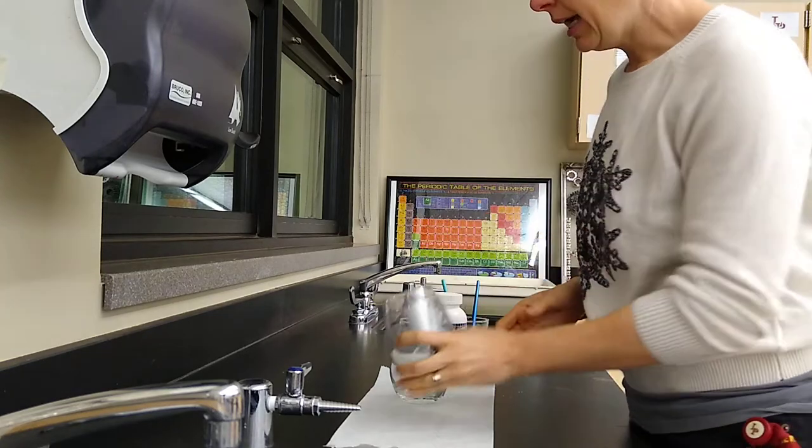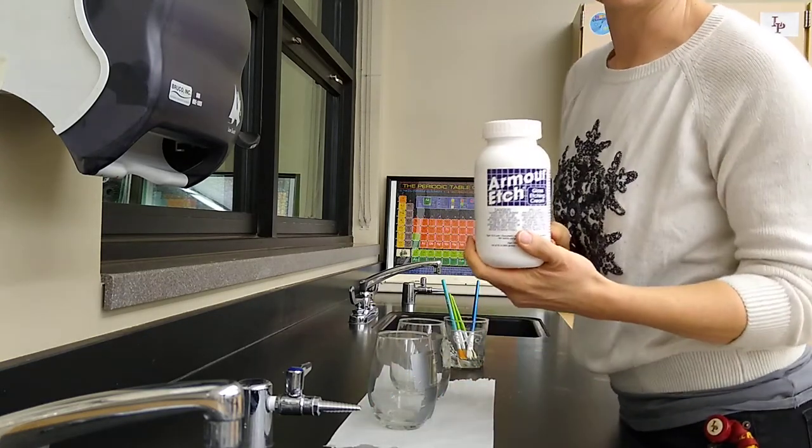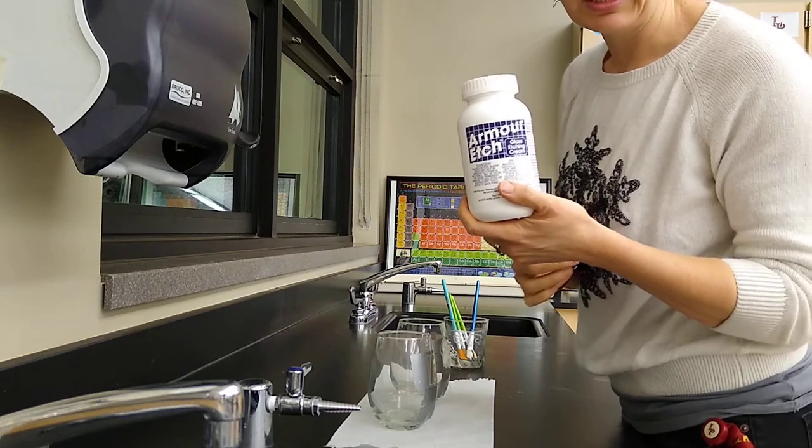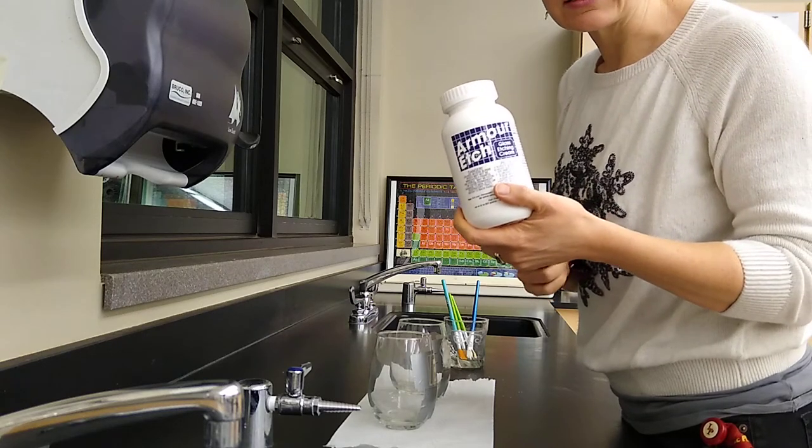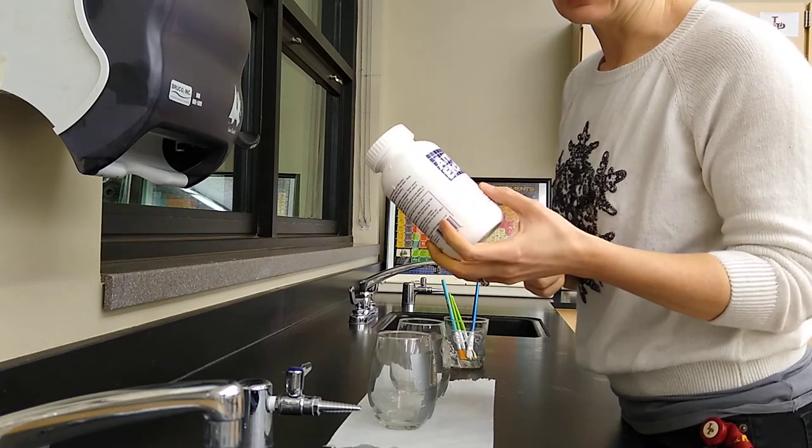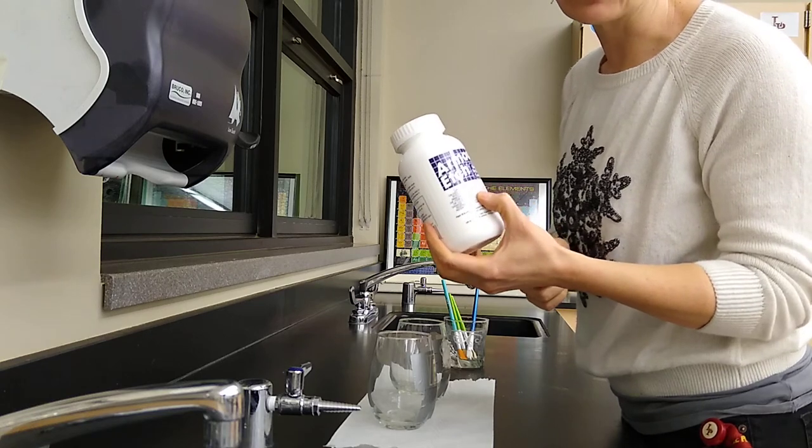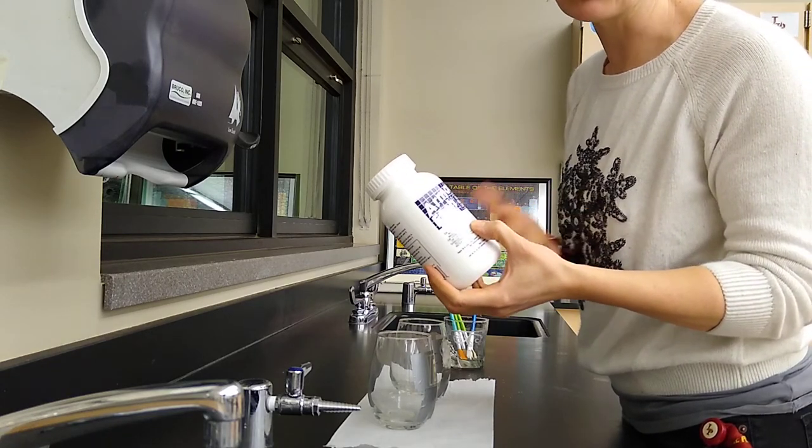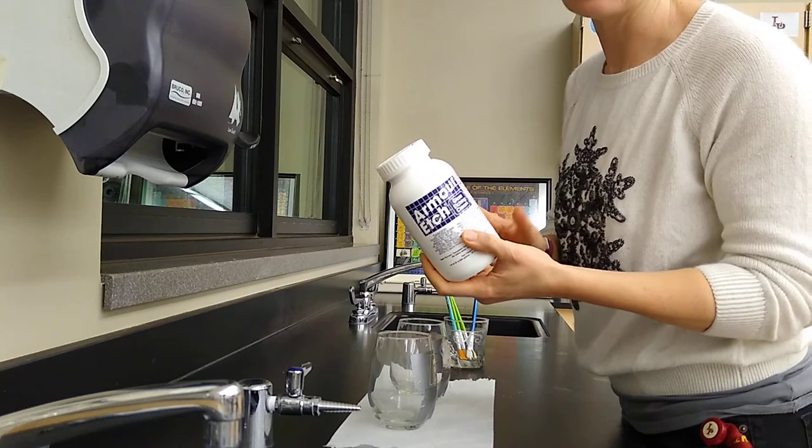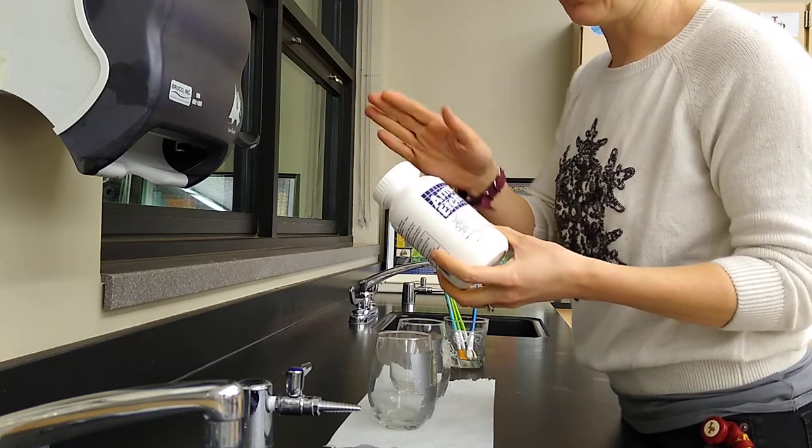You're going to go to the area of the classroom that has this armor etch cream. Now this is hydrofluoric acid, HF, that is totally different from hydrochloric acid, the kind in your stomach. This one will actually eat through glass, which is why it's stored in plastic containers.